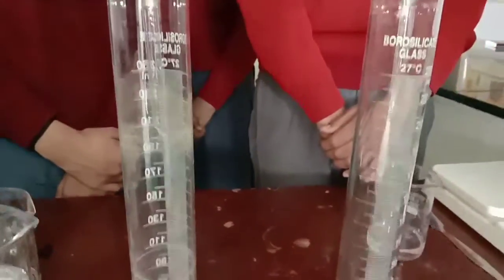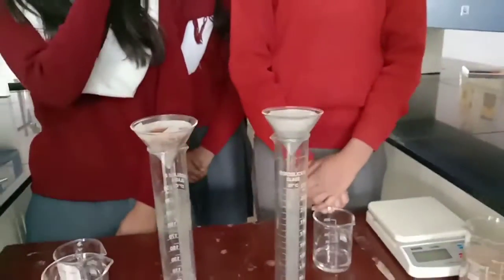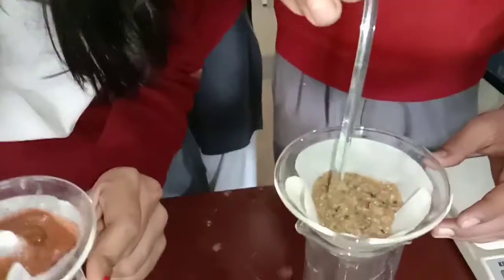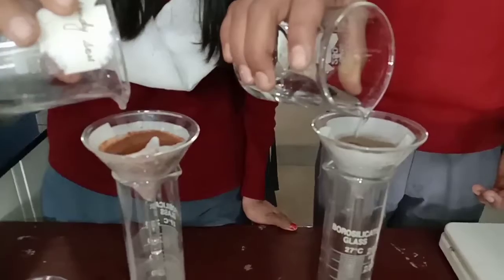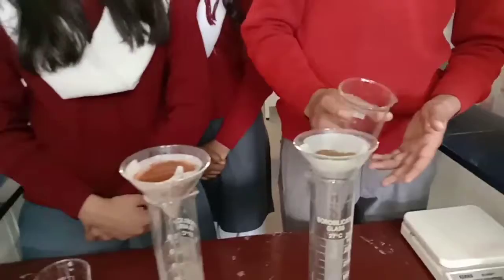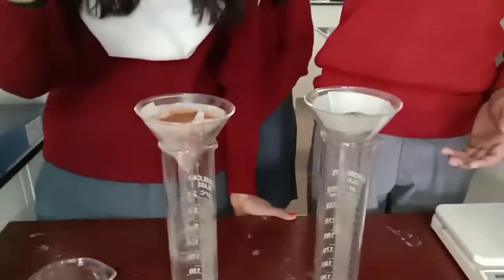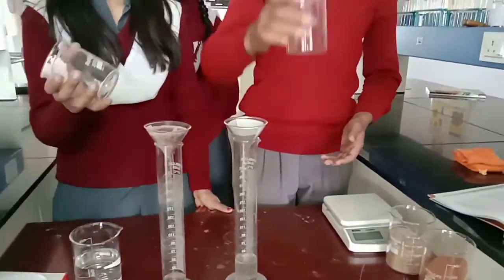We'll also check that all the soil particles get the water properly. No soil particle should be left dry here. And after waiting for some time, we'll again put the rest of the water over this soil sample. All the 50 milliliter of water we have poured over this soil sample. We'll wait for some time and do the observation here.